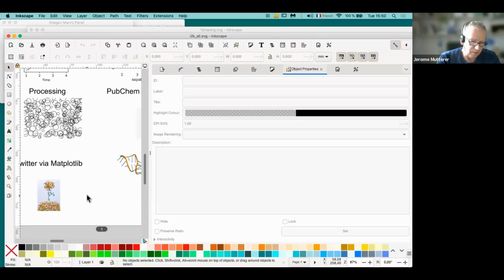script. So if you want to, and this is the good point, because now, and this I almost forgot, but this is the core of this presentation. Now you have a figure, but you also have the code that generates those panels. So if you submit this, or if you want to reuse this, you can go back to the code and to the original data.